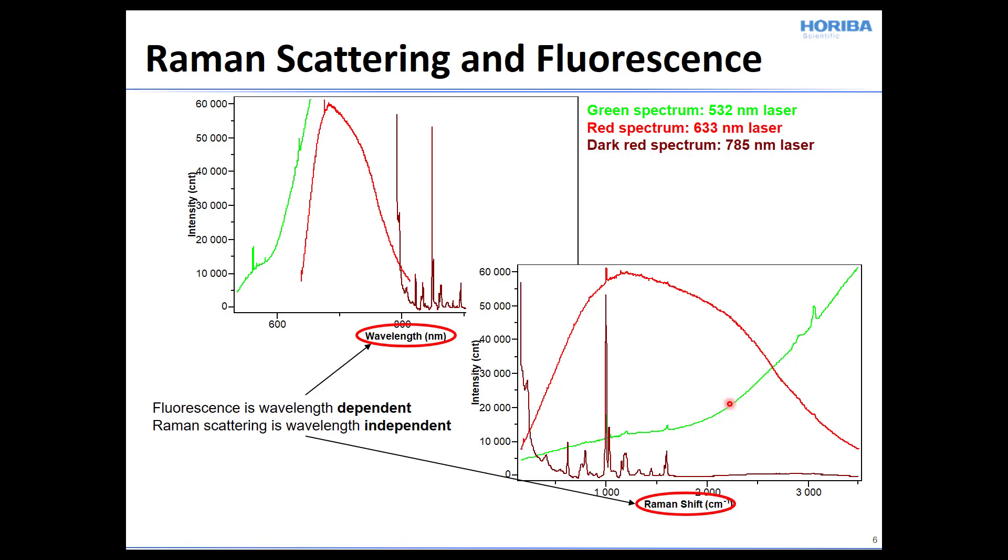Here we're plotting these same spectra on a Raman shift scale. And you can very clearly see how the fluorescence is obscuring the Raman scattering. Now, how does it do that? Well, the fluorescence is of course being detected at the same absolute wavelength as is the Raman scattering by the detector. And that very strong fluorescence signal that you see at 633 contributes then to the noise in the detector.